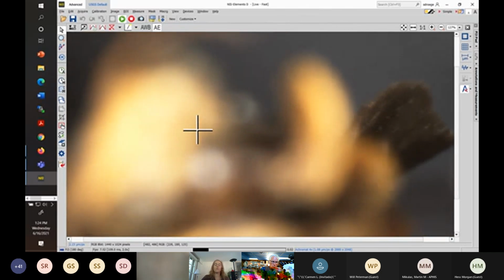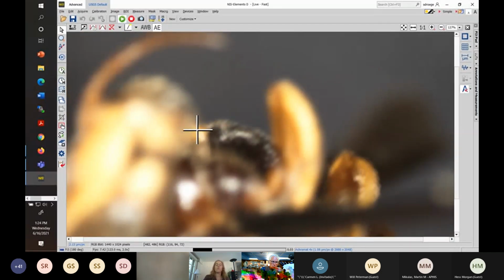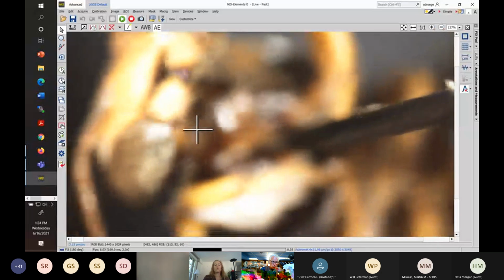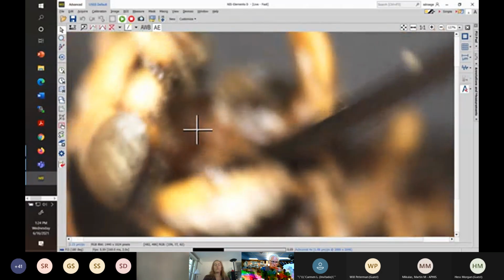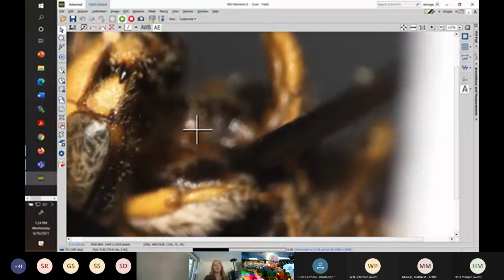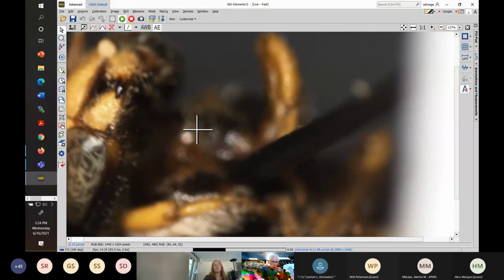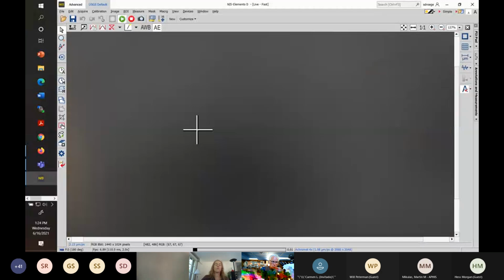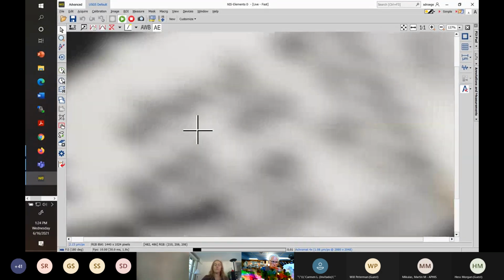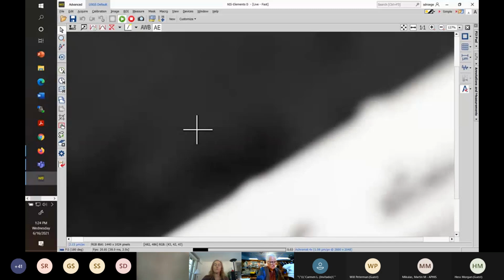Let's see if I can do this by hand to tell. So yeah, first of all, hand holding with this microscope is problematic. It's too dark. So sometimes you can tell without the mandibles open. This is why a lot of people will spread the mandibles for that feature, which we can't see at all. So that's not useful in this particular case.